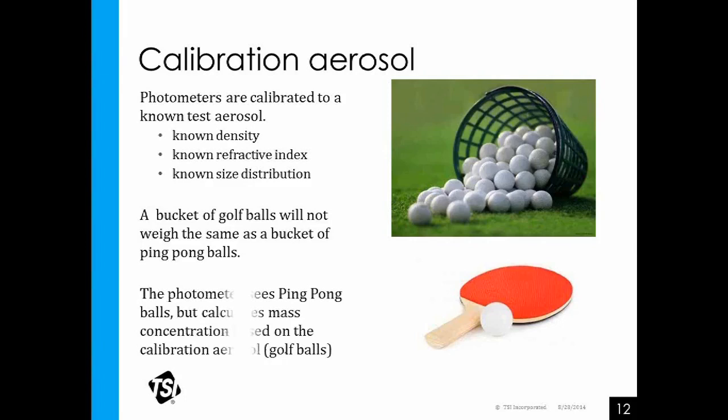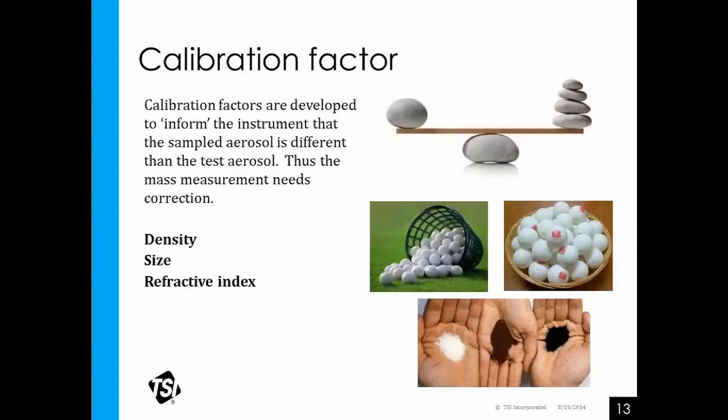We've seen some studies, and we've linked to this with some application notes. Some studies have been done that show the outdoor urban pollution, which is mainly combustion byproducts from airplanes, cars, trains, and burning fuel sources. If a calibration factor of 0.38 is used, then that photometer will read pretty close to what the actual gravimetric measurement is.